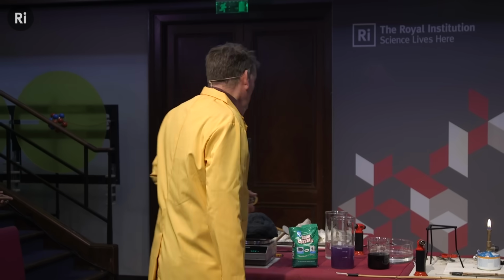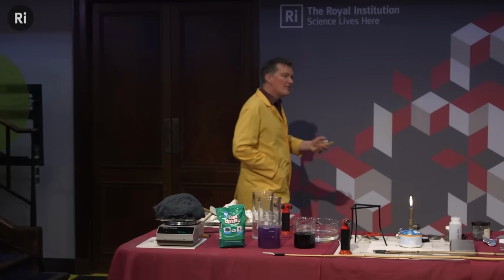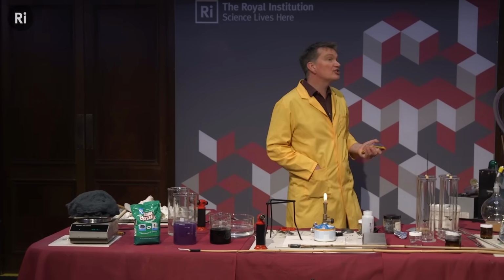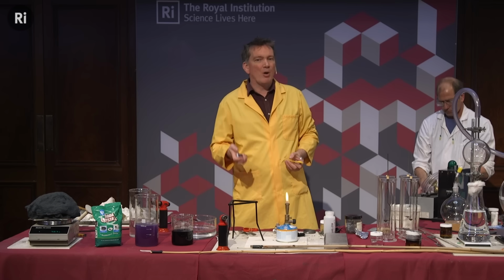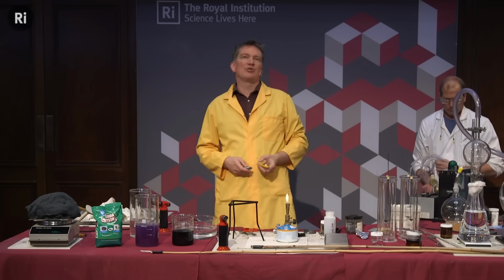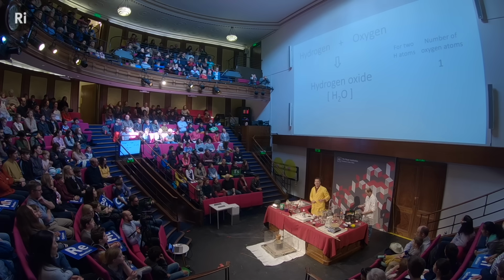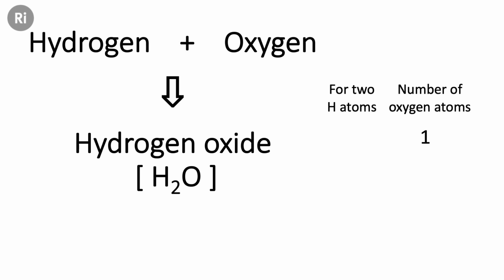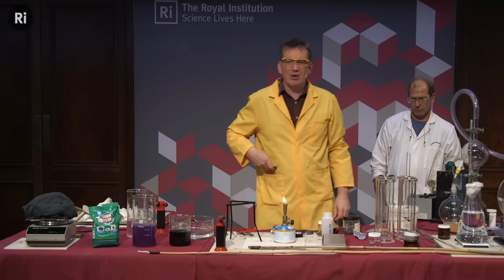So we'll start off with group 1. In fact, we've already seen one of the elements and how it reacts with oxygen. This is, of course, the element hydrogen, and we know the formula of what we get. When hydrogen reacts with oxygen, we get H2O: 2 atoms of the element, 2 atoms of hydrogen, combined with 1 of oxygen. But it isn't just hydrogen that this is the case. Other elements can also form similar compounds with similar formulae.